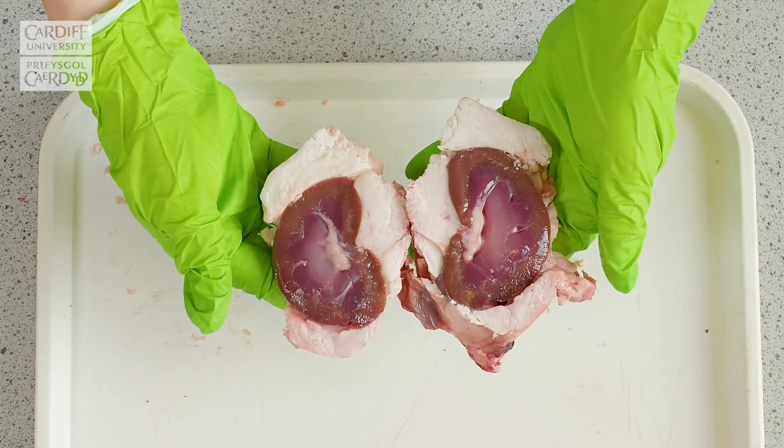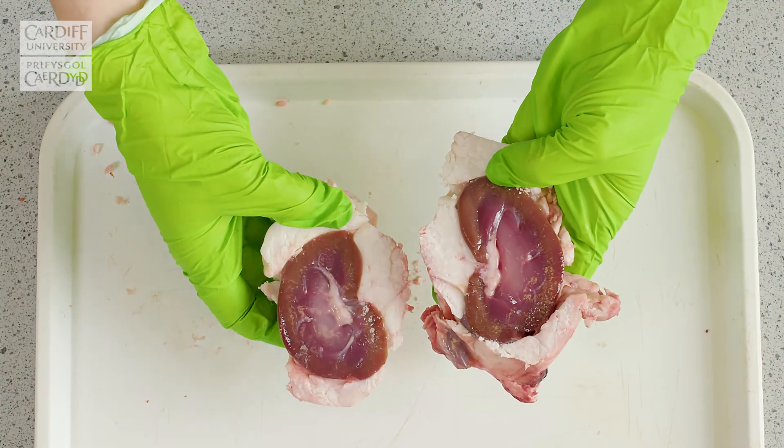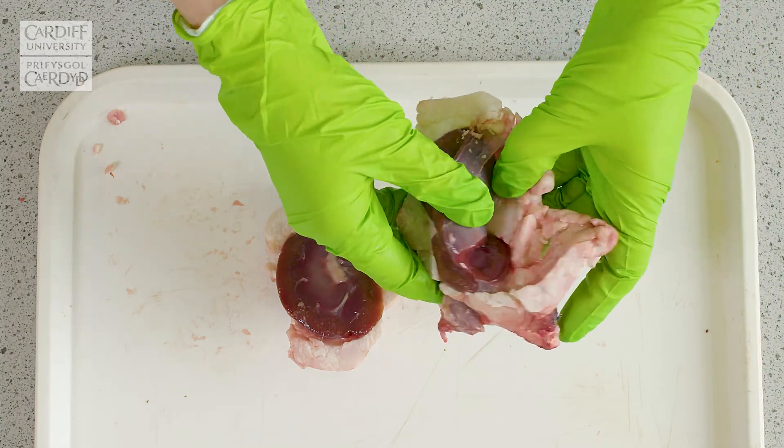So what you'll see there is the kidney has been cut down the middle, and now that the cut has been made, it's easier to remove the fat from the kidney itself, just by peeling it away with your hands.